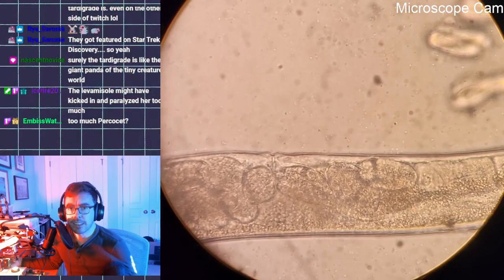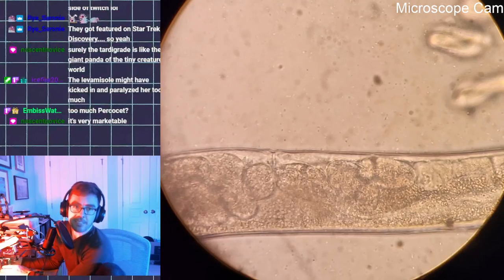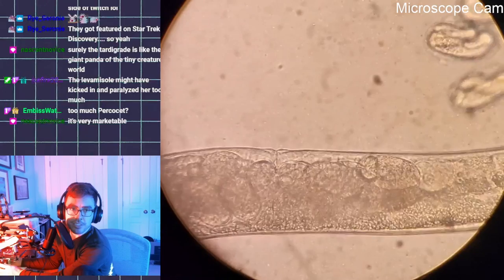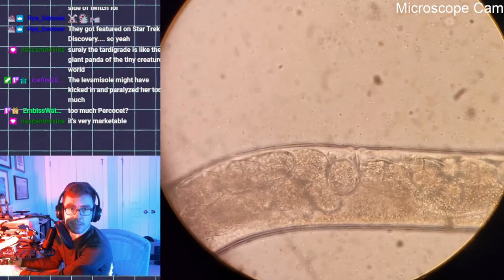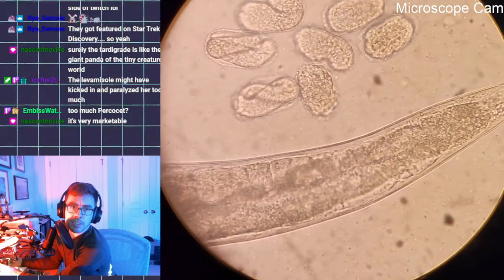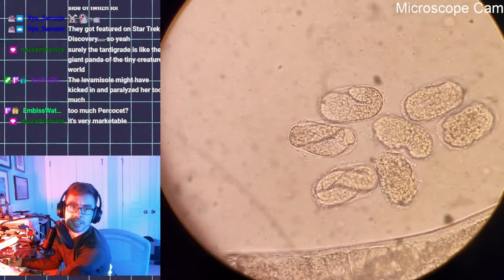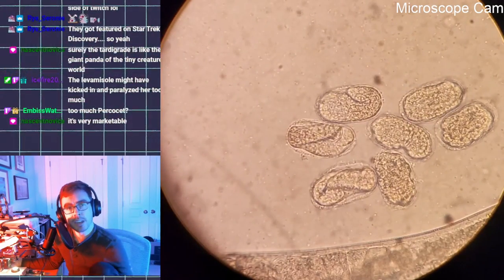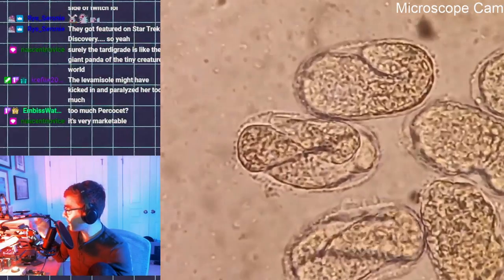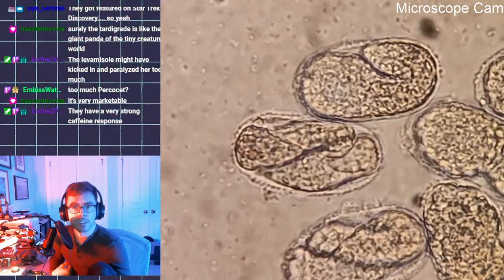The levamisole might have kicked in and paralyzed her too much. Oh no. Too much Percocet. Is there an anti-levamisole? Can I go make myself a coffee and just drop some caffeine in here? That probably won't do it. Meanwhile, this sad little clutch of eggs. They're moving around. They're probably safe. It's very marketable, that's for sure. I like the one on top that's kind of folded over.